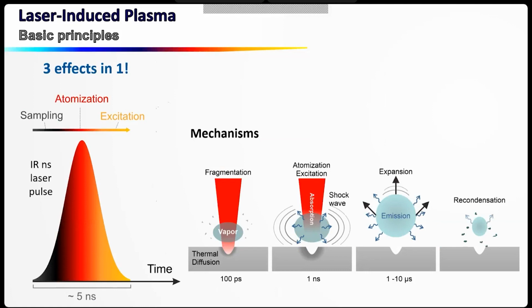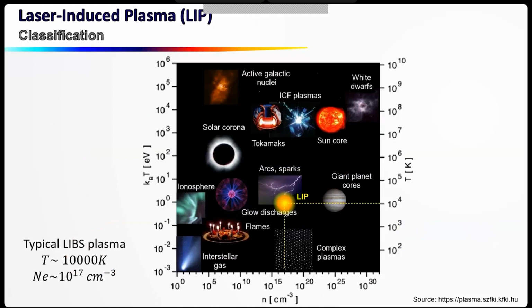And then there is the expansion, the emission, and finally the recondensation and the cooling down, and no more emission at this stage.